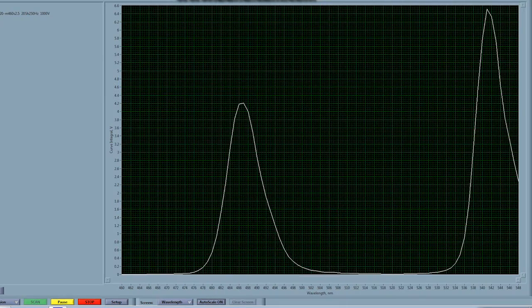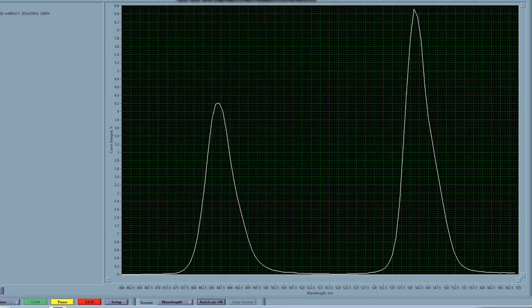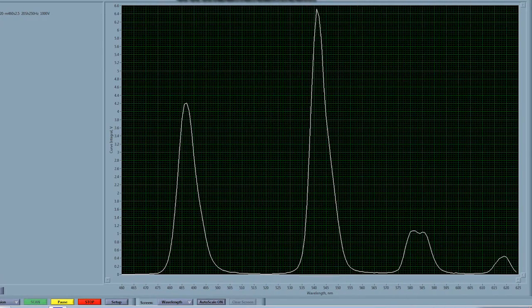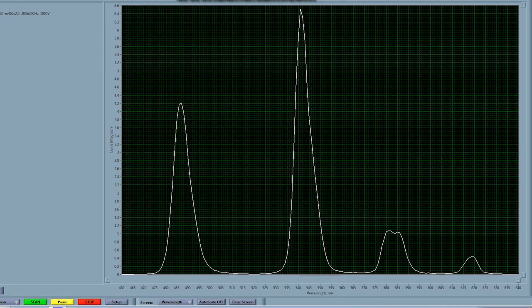So in this case the software is auto scaling to fully show the entire spectra as it goes and it gives you a real-time display of the, in this case, the emission spectrum of terbium.